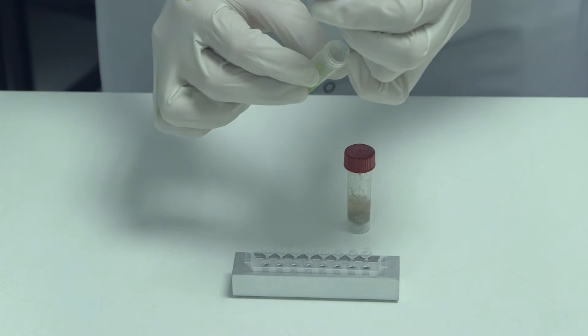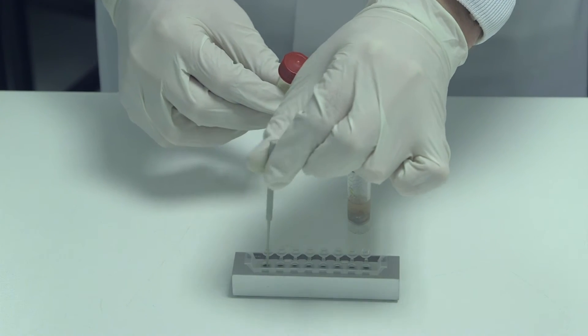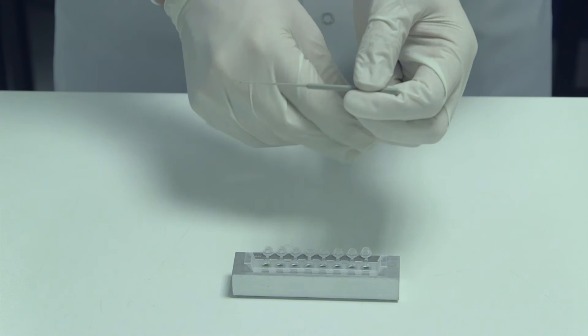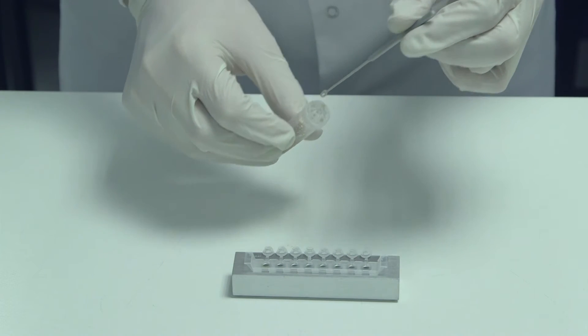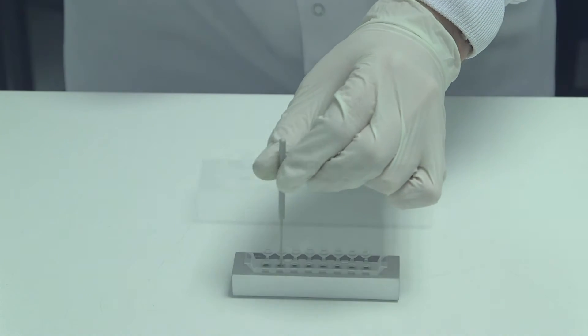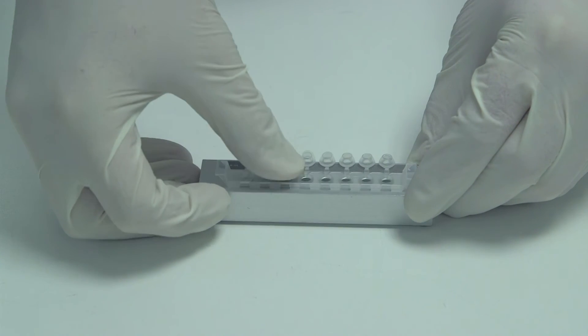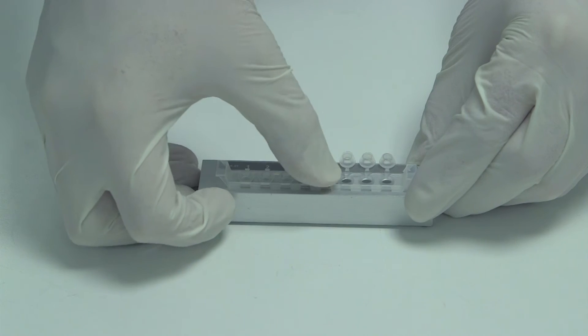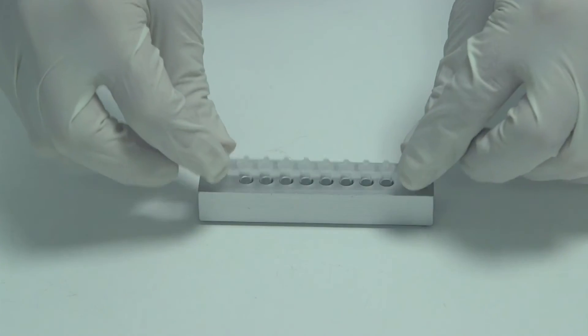The strip contains all the ingredients necessary to perform the amplification. Cap the strip. When all samples have been transferred to the strip, load the strip into the instrument. Choose the assay and start the run.